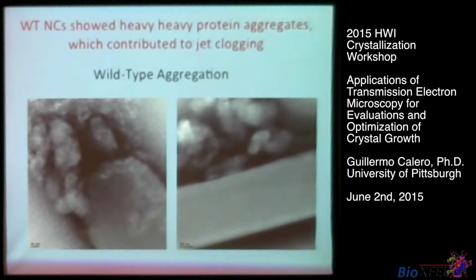So the problem here was the prep was contaminated with another protein. So she said when the person that set up the trays set them up, she didn't look at the sample. The sample had this contaminant, and basically the contaminant resulted in polluting the crystals. And they had these two types of crystals in the same sample.